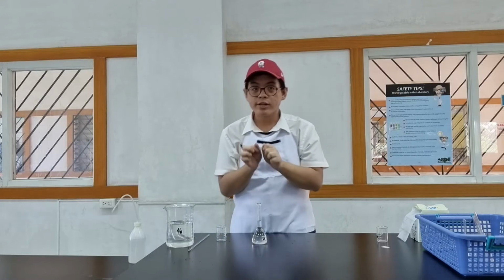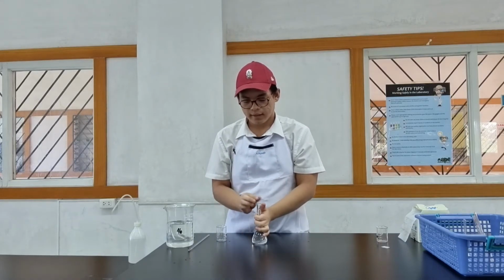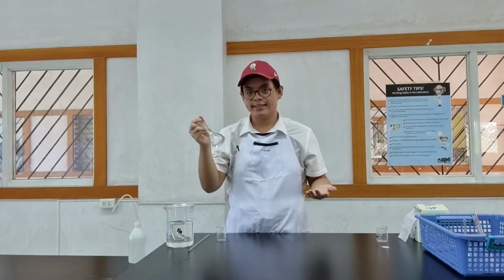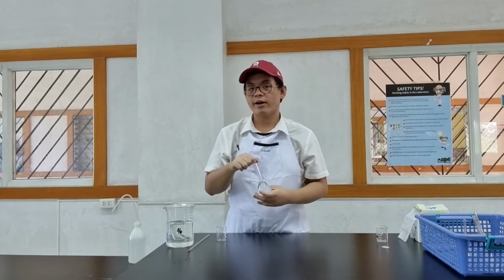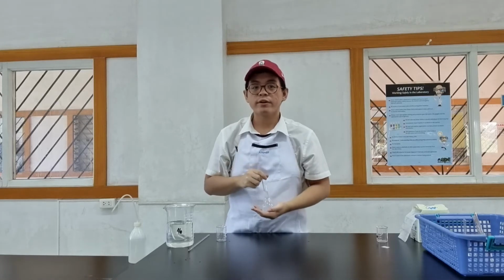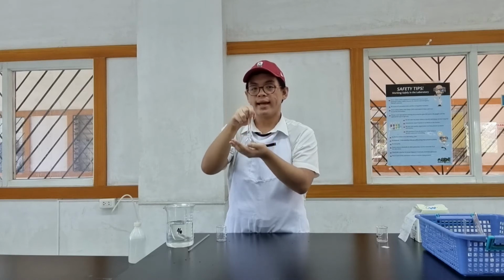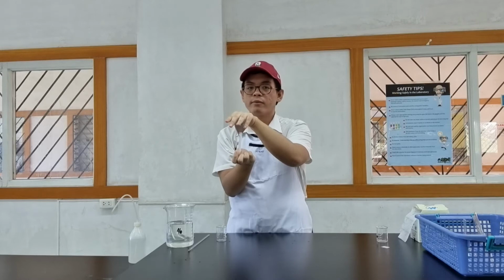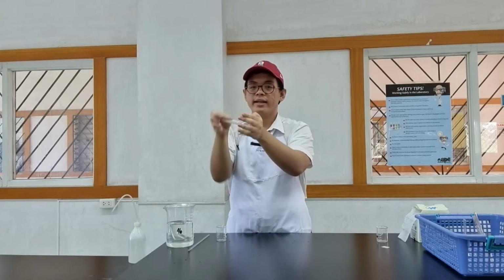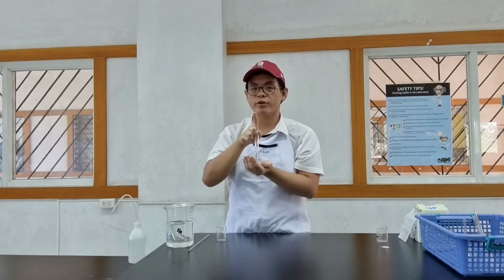I apply the stretched out parafilm onto the mouth of the volumetric flask. I seal it. Now it's completely sealed. To mix it, I need to invert this around 36 times. So to invert this, I hold the base with my left hand and the top with my right hand, and then I invert. If you did your parafilm correctly, nothing should come out. I shake it, and then I return. That's one time. I need to do this 35 more times.